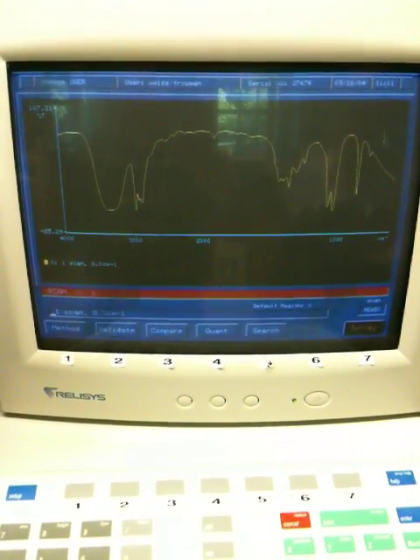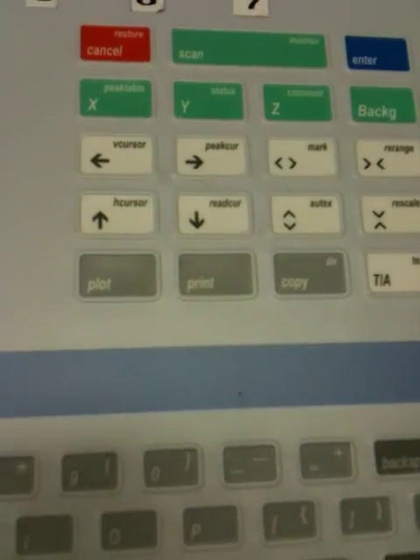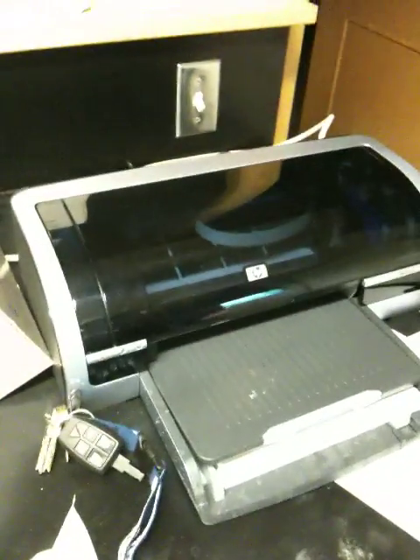If I want to print the spectrum, I don't hit print — I hit plot. So I would hit plot and it should plot. It's going to start plotting.